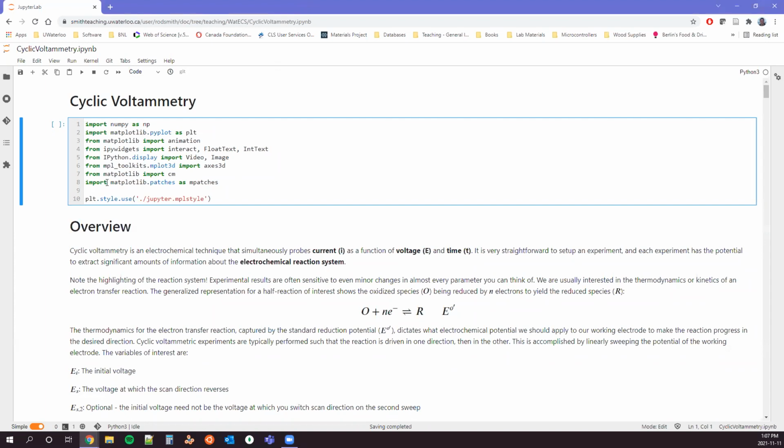Thank you for the invitation to come and talk about cyclic voltammetry. It's given as kind of an open-ended, give a description of any aspect that you want, more tutorial style. Of course, CV is one of these techniques that is wonderfully simple and ridiculously complex at the same time. And so I decided to do a span. We're going to start with some of the fundamentals to really establish the basics of what dictates what you see in a cyclic voltammogram. And then we're going to go through some of the more complex and touch on some of the more advanced ways in which you can apply it towards the end.